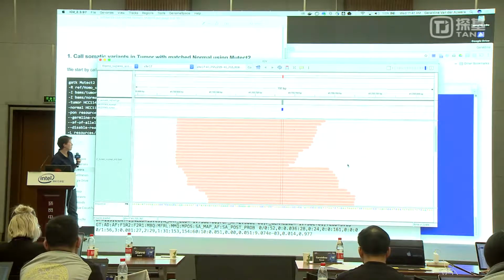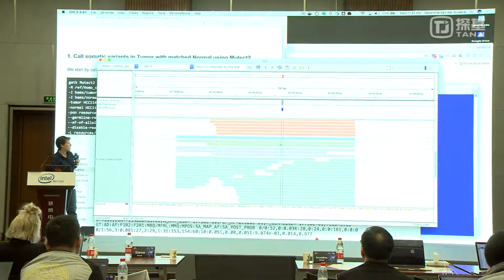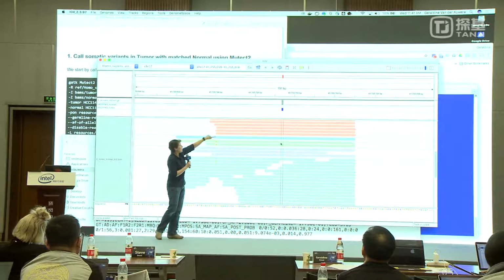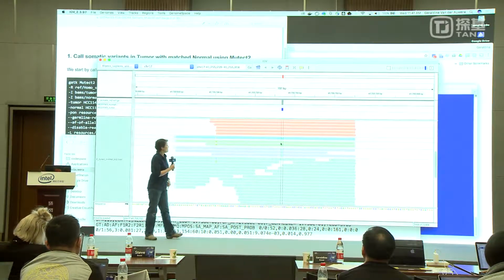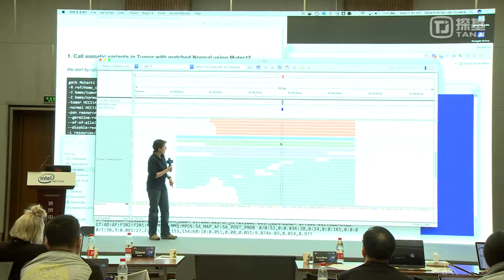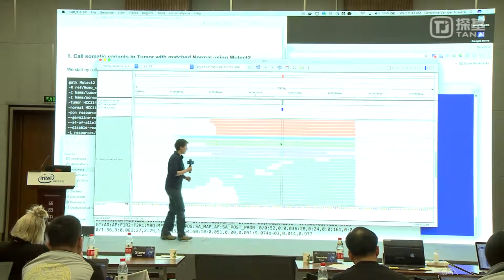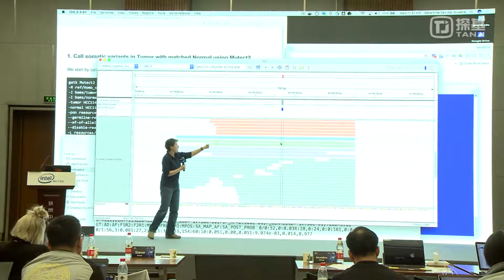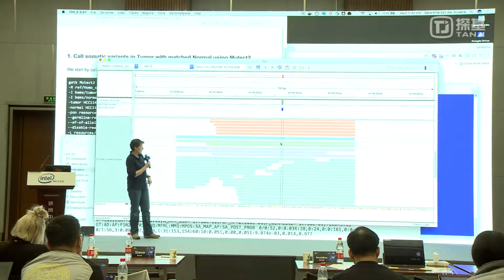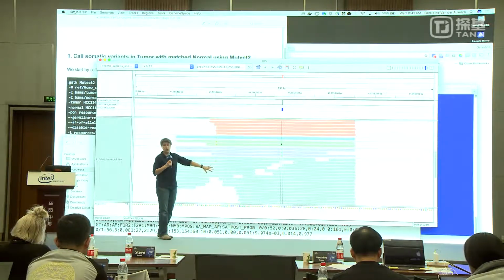see that I have a whole pile of reads that are supporting reference. I have 2 reads that support this haplotype, which is based on this little G allele here, although it's not very convincing, it's not actually. And then I have 2 real reads that support this artificial haplotype. And here it's just 1 read and 1 haplotype, so that's why this was probably pointed out as not being very likely at all. And you might wonder, why are some of the reads gray?